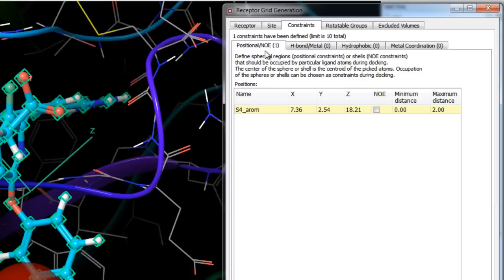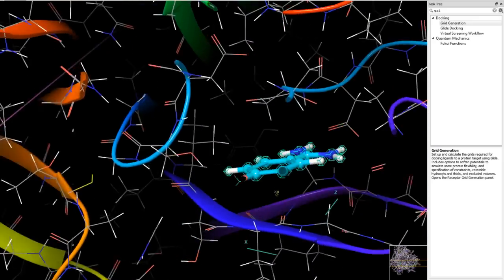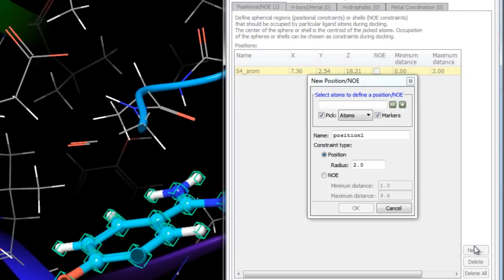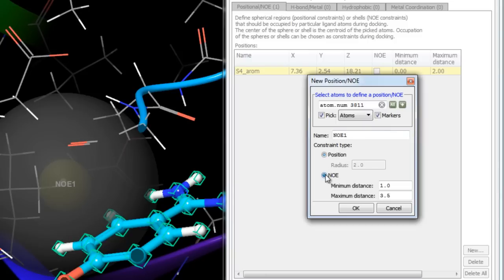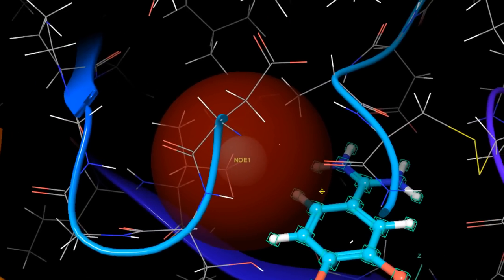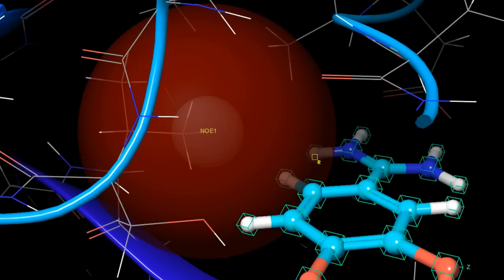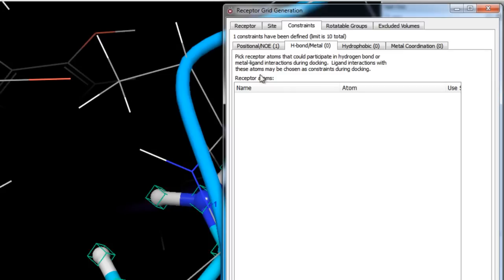NOE constraints are similar to positional constraints but require that ligand atoms lie within a given distance range from the constraint center — i.e., in the shell between two spheres. This is similar to interproton distance constraints estimated from nuclear Overhauser effect spectra. For example, if we know the ligand is somewhere between 1 and 3.5 angstroms from a valine, click New from the Positional/NOE tab, pick the atom, choose NOE as the constraint type, and specify the radius minimum and maximum. In this exercise we'll only use the positional constraint, so let's delete the NOE constraint.